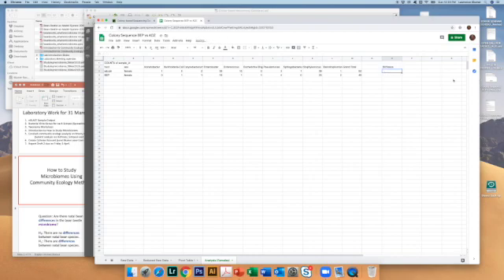And then what we want to enter there as a formula to actually do this calculation for us is a formula that's going to allow us to count the number of different genera that have non-zero values in them. And so we can do that fairly easily. That count, it's the same command as we would use in Excel. It's COUNTIF.